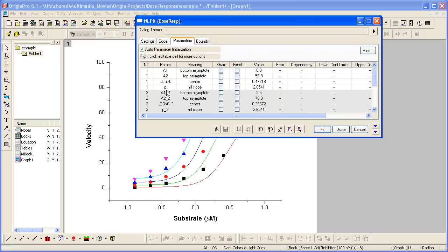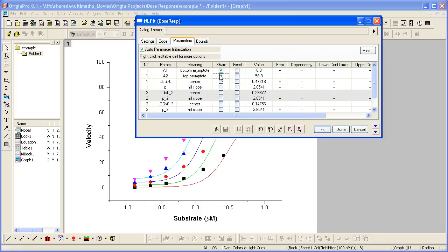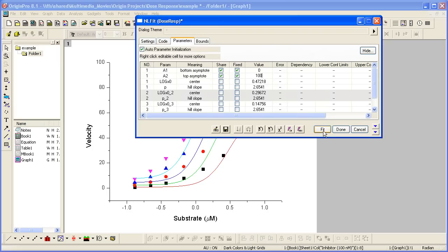And as I do that, you'll notice that A1 and A2 will disappear from the other sets of parameters. So we share those two. We also want to fix their value from 0 to 100. I can then click the Fit button.